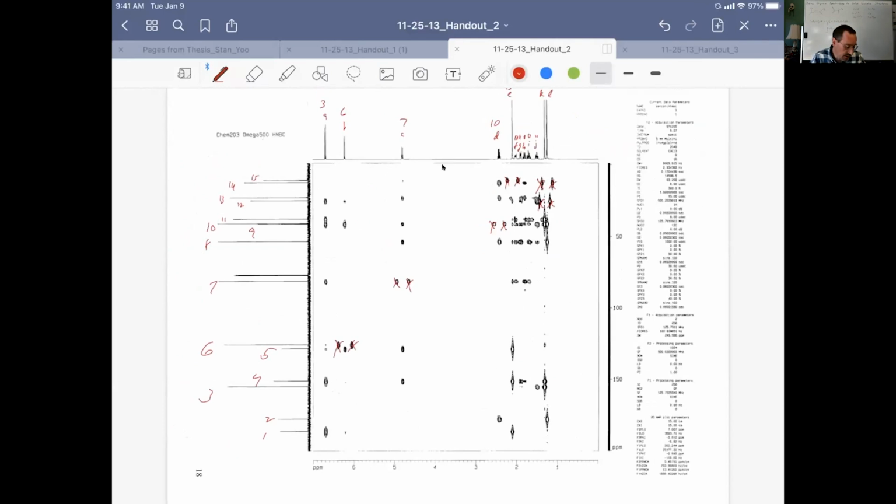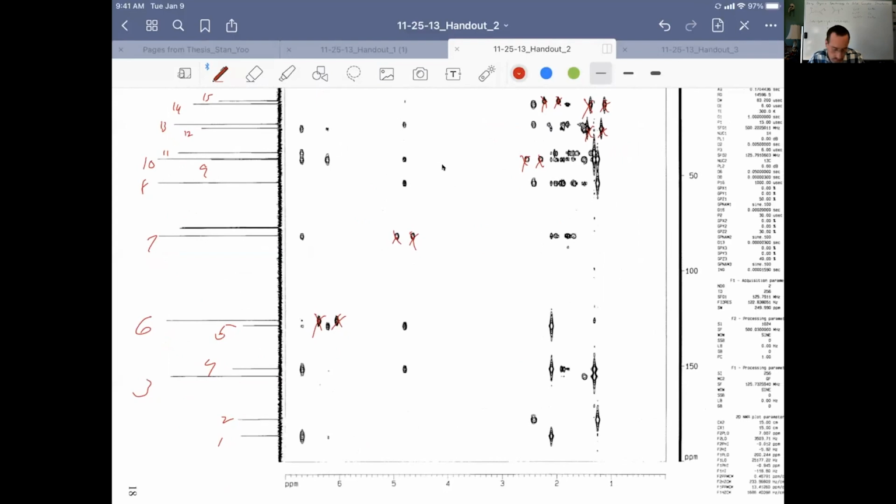As I said, there's a lot of data here. I'm going to focus on a few isolated peaks that I want to try to place. So for example, we see that we cross 1 with 3A. It looks like we cross 1 with 6B. I'll put a little bit of a question mark there since that peak is really weak. We cross 1 with 15E.